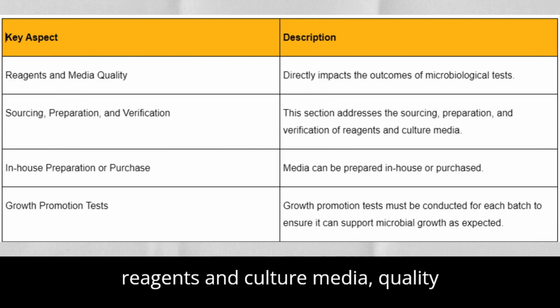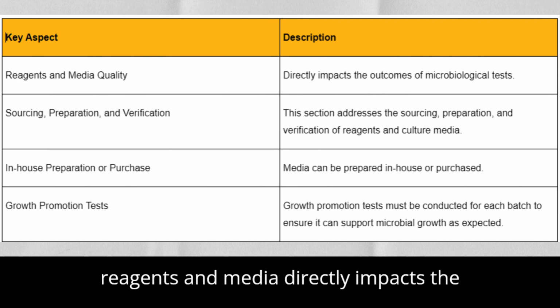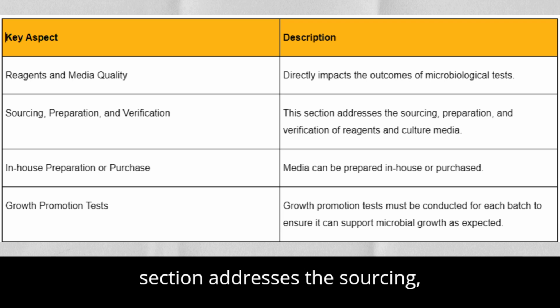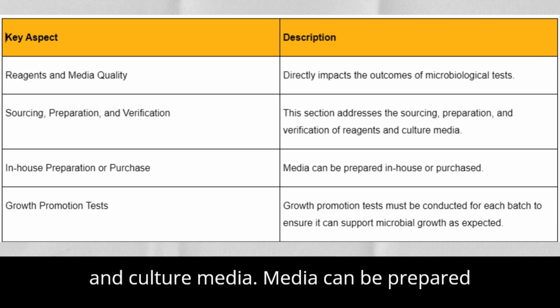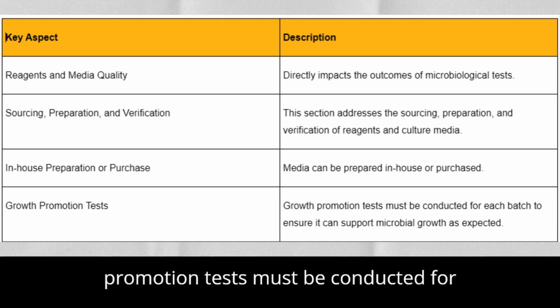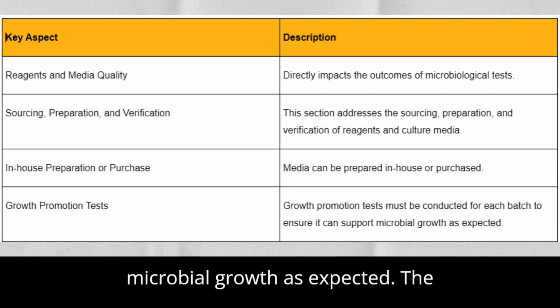5. Reagents and culture media, quality control practices. The quality of reagents and media directly impacts the outcomes of microbiological tests. This section addresses the sourcing, preparation, and verification of reagents and culture media. Media can be prepared in-house or purchased, but growth promotion tests must be conducted for each batch to ensure it can support microbial growth as expected.